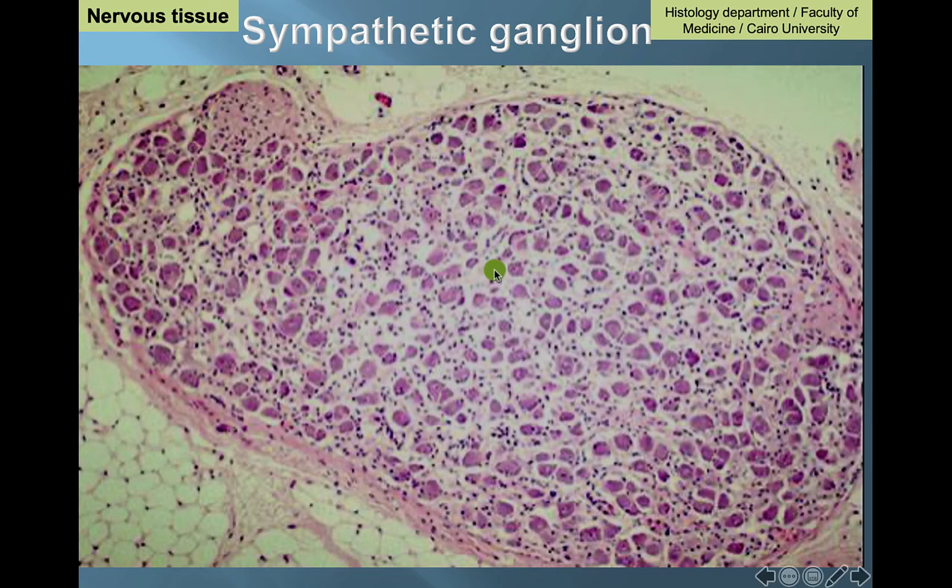In between, you can see these areas representing the site of the nerve fibers. The nerve fibers here are unmyelinated.